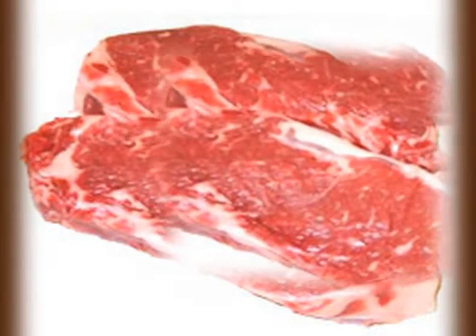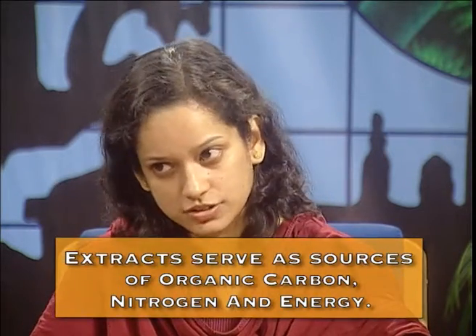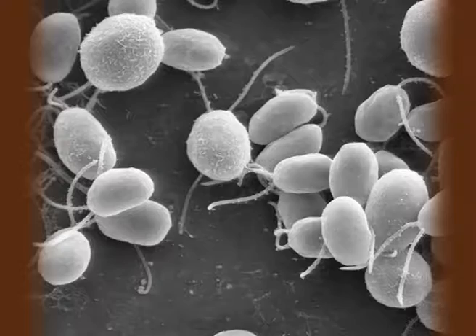Besides the major, minor, trace elements and vitamins, sometimes the media consist of other important additives. What are the important additives? Like it may contain extracts, which are derived from plant or animal tissues and serve as sources of organic carbon, nitrogen and energy. Again, the media may contain certain pH indicators in order to differentiate between the different kinds of bacteria growing on the same media. Sodium chloride plays an important role in the culture medium and is often an ingredient in common bacteriological media. Sodium chloride helps to maintain the osmotic balance of any bacterial cell.